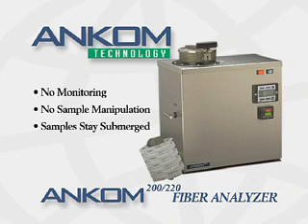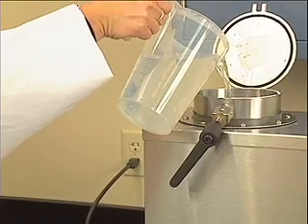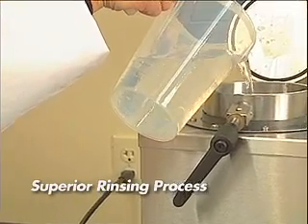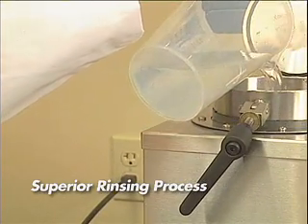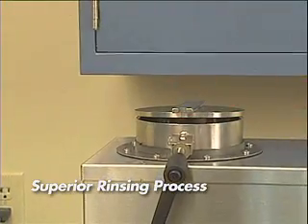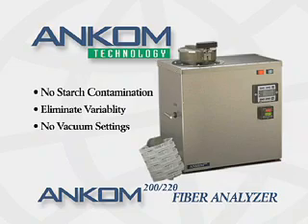With ANCOM filter bag technology, the sample is always submerged in solution with constant agitation. Also with filter bag technology, there is no need for a separate filtration step. The process is completed during the rinse steps within the analyzer, so you don't have to worry about starch contamination, technician variability in setting the filtration vacuum, or other problems inherent in the more manual methods.